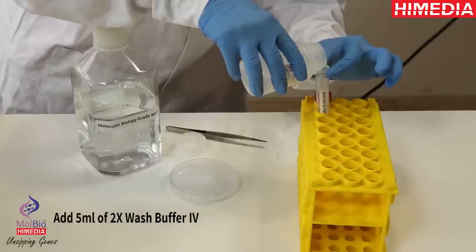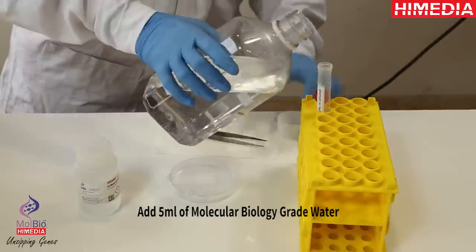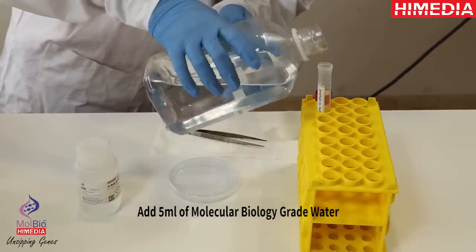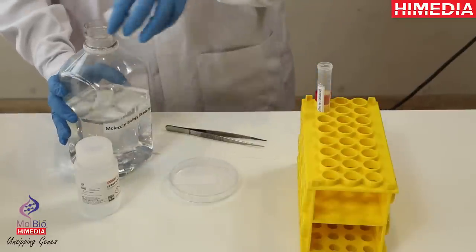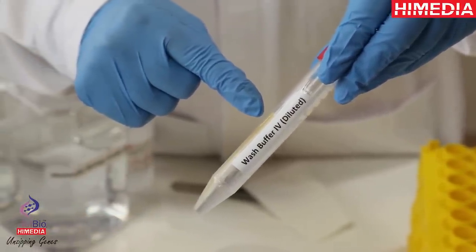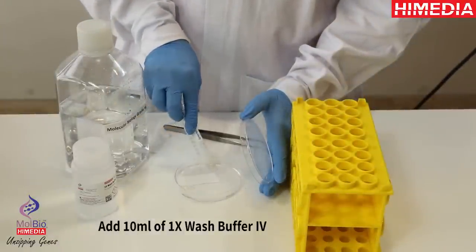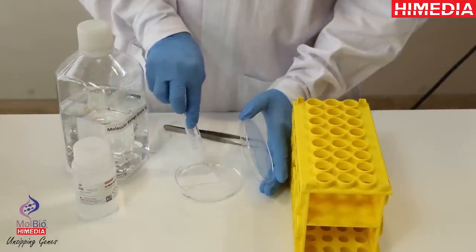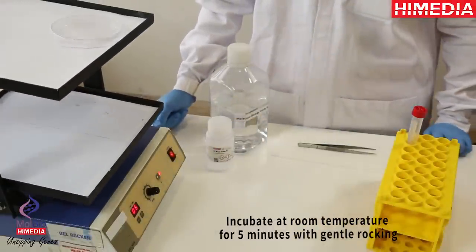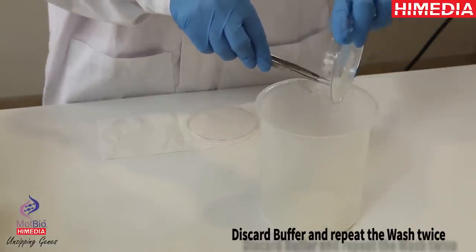Add 5 ml of 2X wash buffer 4. Add 5 ml of molecular biology grade water. Add 10 ml of 1X wash buffer 4. Incubate at room temperature for 5 minutes with gentle rocking. Discard buffer and repeat the wash twice.